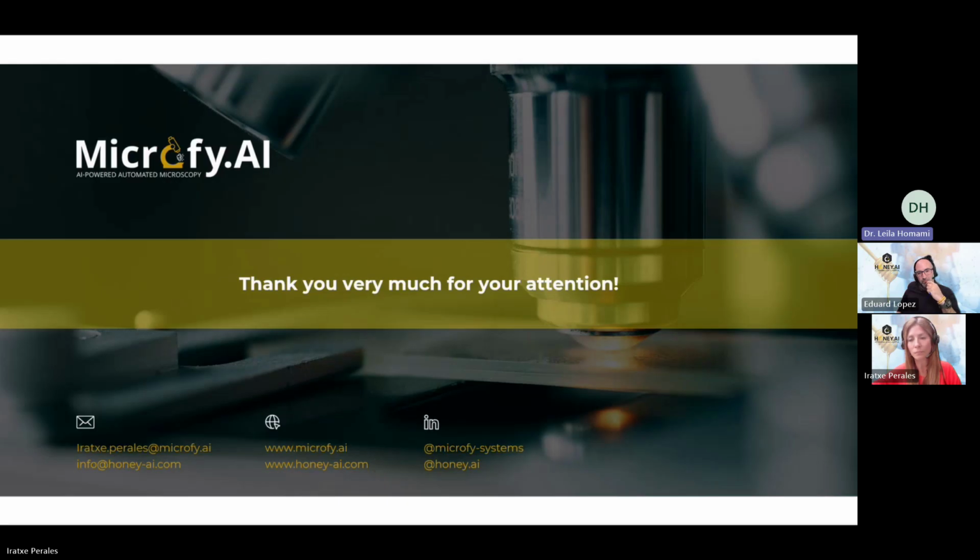In 1 or 2 fields, we can reach a high amount of pollen, so the validation for rapeseed honey is not that complicated, but for some sorts of honeys, it's really complicated. And when we say the whole project is based on 53 samples, it's a little bit tricky for me. Can you talk about these results? The 53 samples, were they mostly focused on which sources of honey and in which region of Europe? That's really important for me.